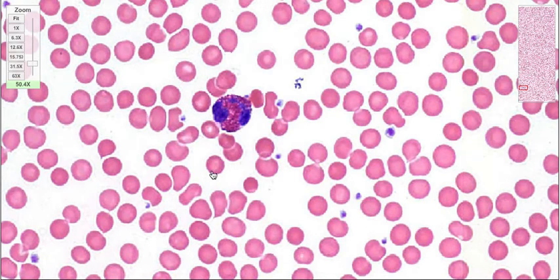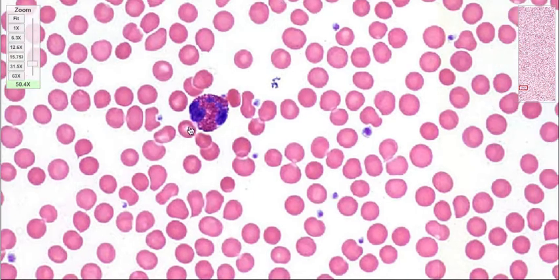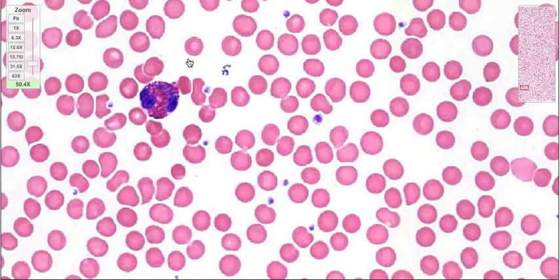And they also are kind of rarer to find. So if you do luckily see one, you'll be able to determine it straight away because it will look different from a neutrophil. So always jump back to the neutrophil quickly if we can.